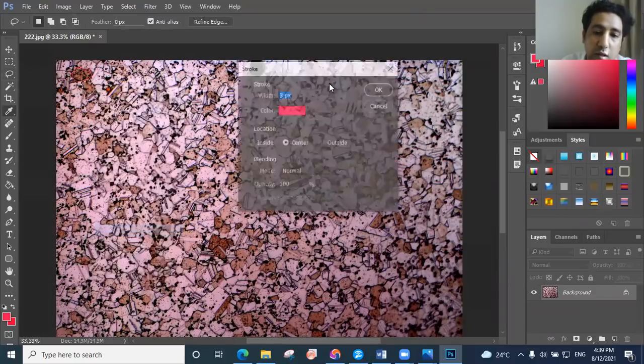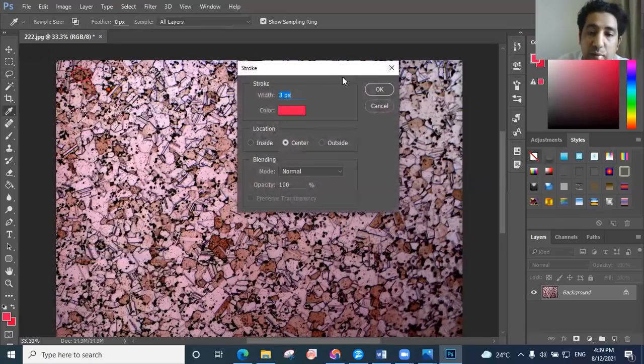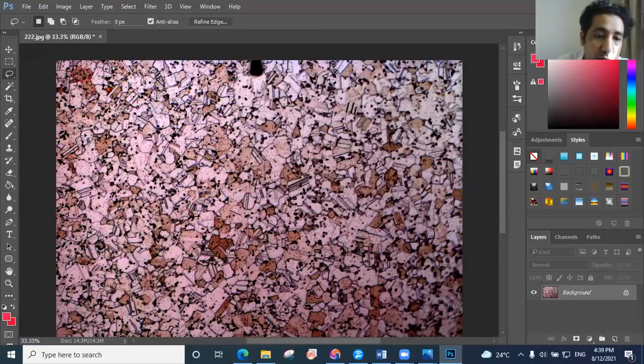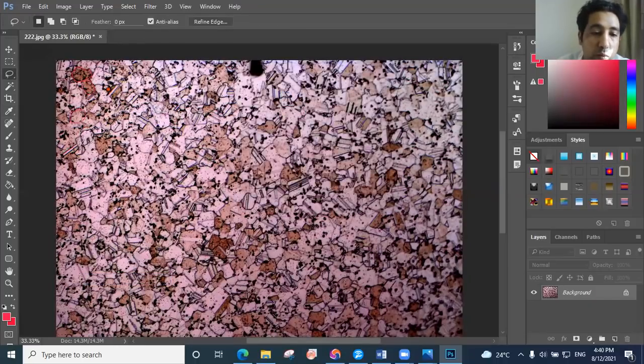I'll show you step by step until I finish this, because you will find some problems when you do this, and then you will not know how to do. Finish circling all the grains step by step with me. I'm doing all the grains here, and then the same step. Don't worry, I'll show you every detail or every mistake and how to solve them when we face them.